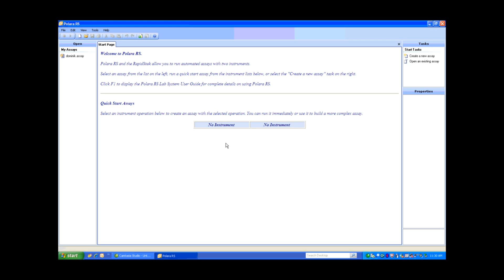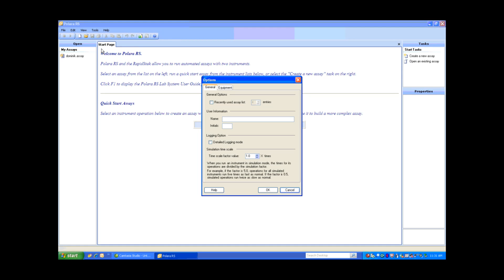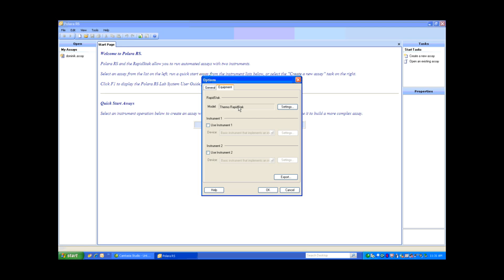The first thing we need to do is add an instrument to our system. Right now you can see that no instruments are added. We're going to go up to the ribbon control, select Tools, then under Tools we'll select Options. This brings up our Options box. We're going to go to the Equipment tab, and you can see I have the RapidStack there.